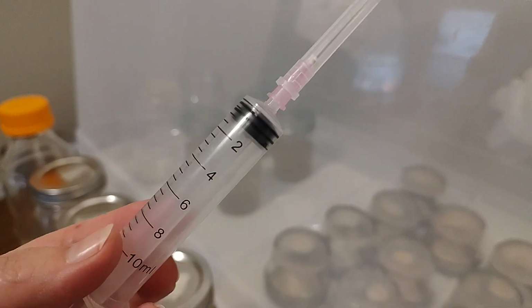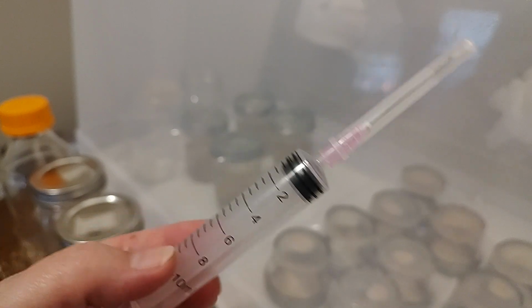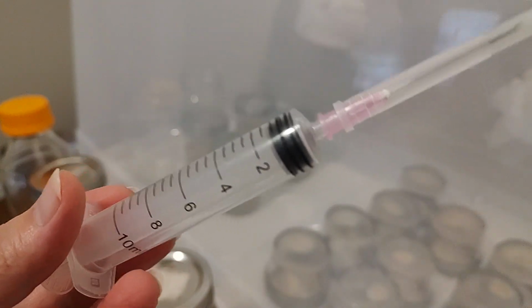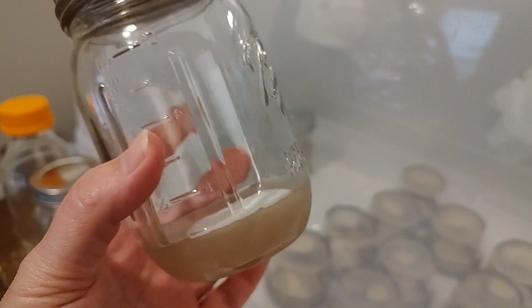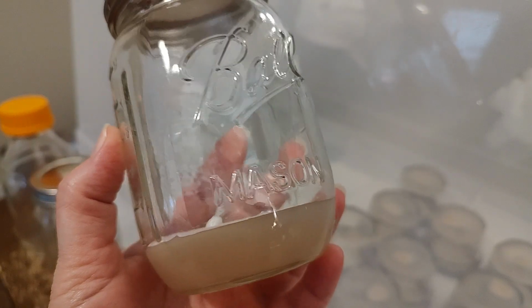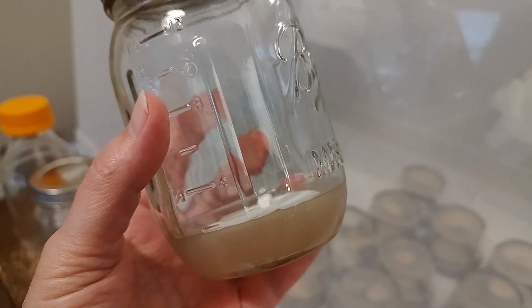So no matter how you get your spores, whether it's in the liquid, in a syringe, you know, there's so many ways that spores come. And you can also make a spore print yourself with foil. So when you have a spore, no matter how you have it, you can simply put it to an agar dish, an agar plate, a no-pore jar like we have in here, and allow your spore to grow out to mycelium. You can also clone fresh or wet fruits. That's right, you can. So no matter what mushroom you're wanting to grow, if you could get your hands on a fresh version of that, you can clone that. So whether you have the wet or fresh mushroom, you can clone. Whether you have the spores, you can turn the spores into mycelium. And that's what we recommend, because you're going to be so much happier with the fruits from mycelium.